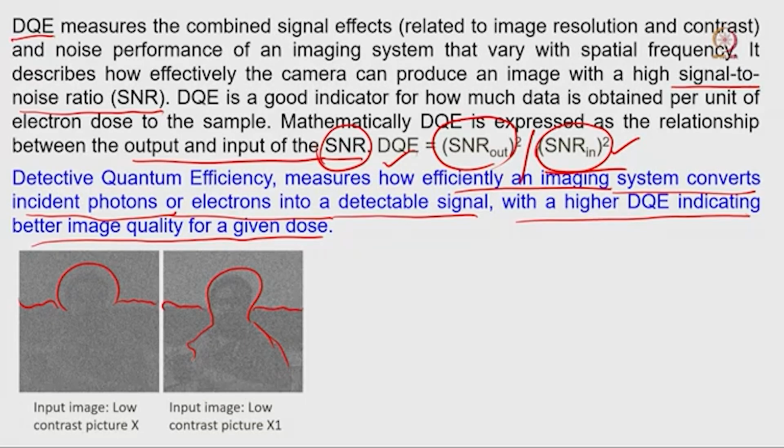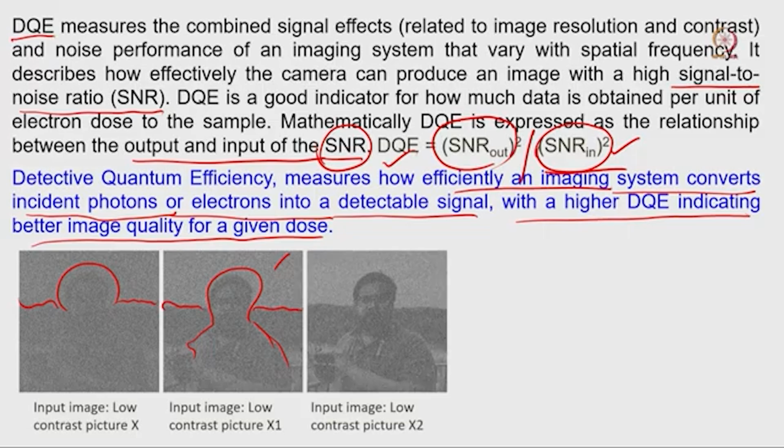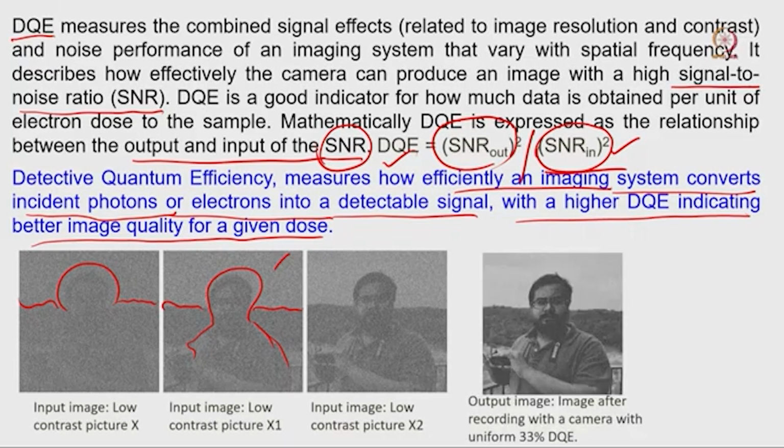In this case we can consider the signal to noise ratio to be about 1:1. It is not that prominent, the noise level is so high that the signal is just equivalent to noise, so we cannot figure out what it is. But if you have a good quality camera and we can record a very good image, you can see this is the image.